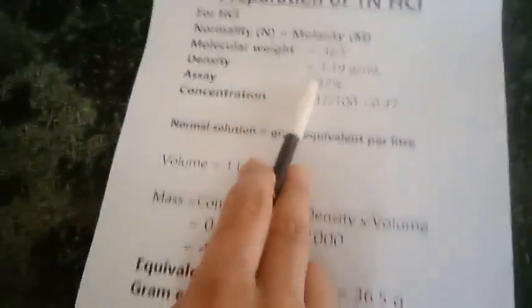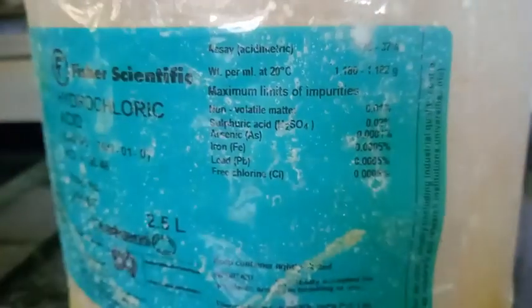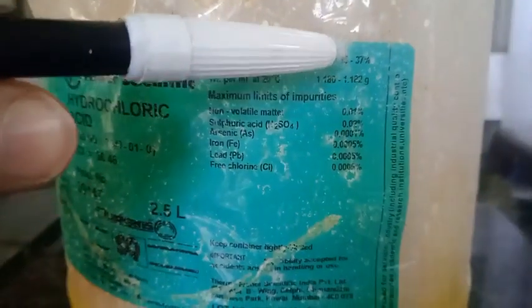I am going to discuss this later on. Here is the molecular weight of hydrochloric acid which is 36.46, so I have written it as 36.5. And here is the given assay as well as the density of the HCl solution.